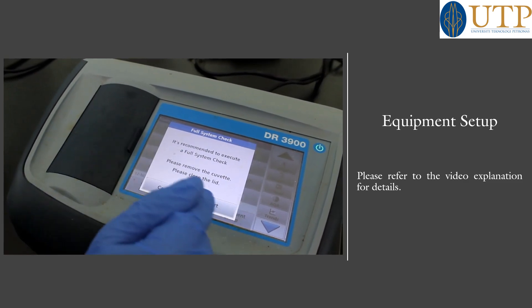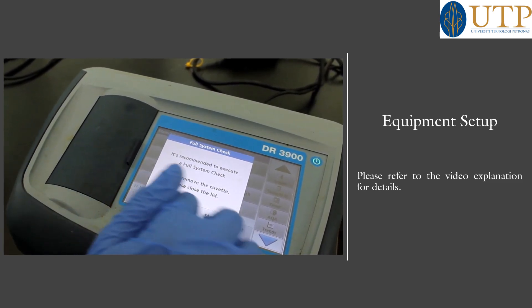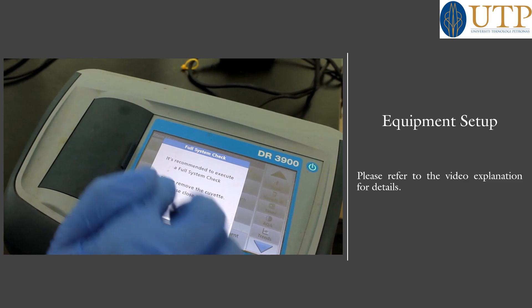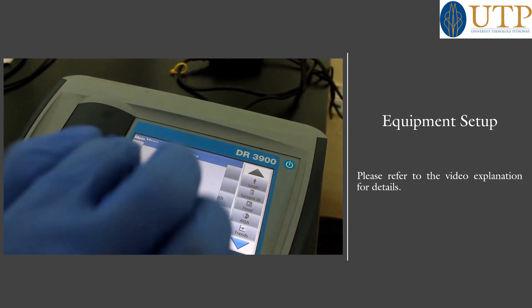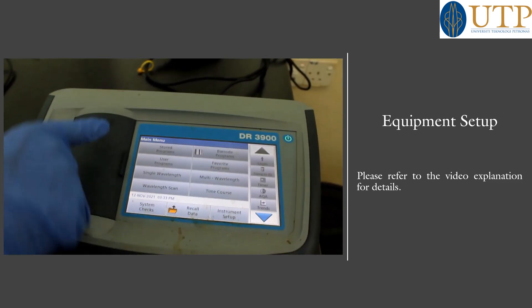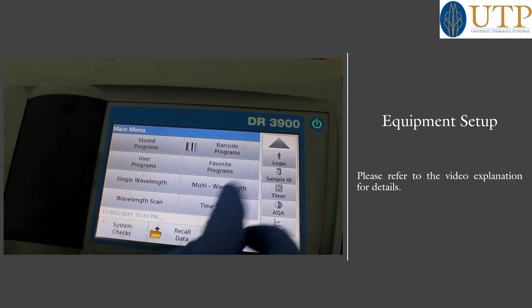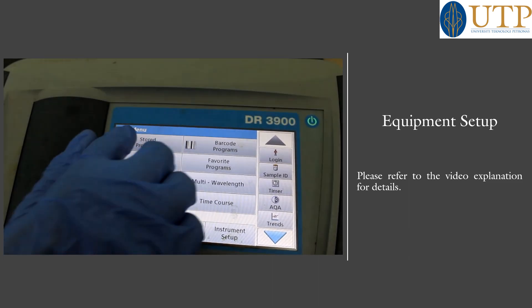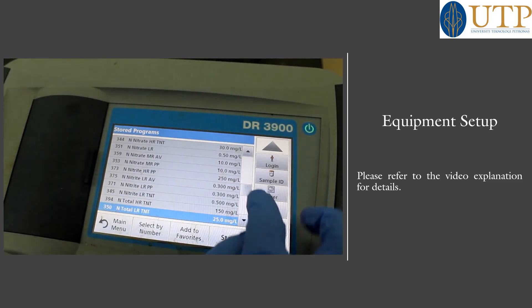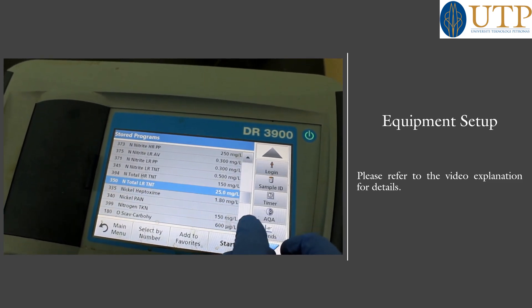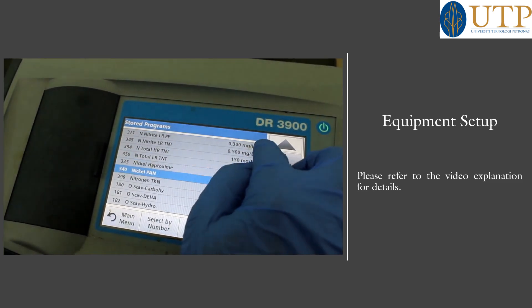When we check, the system is already closed, so we press Cancel because we are going to switch. This is the main menu. We have stored programs, user programs, single wavelengths, and so on. We go to the stored programs, because this has been used by so many people. In stored programs you can see nitrate — you can scroll up to look for whatever contaminant parameter you want to test: organic carbon HR, COD, and others.